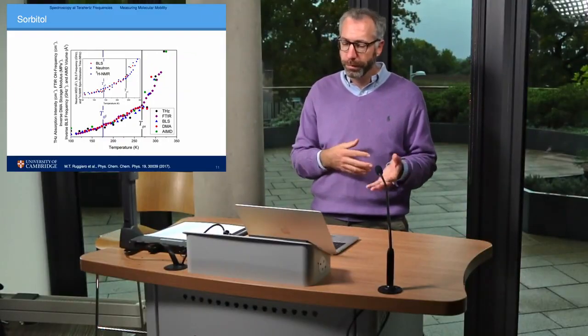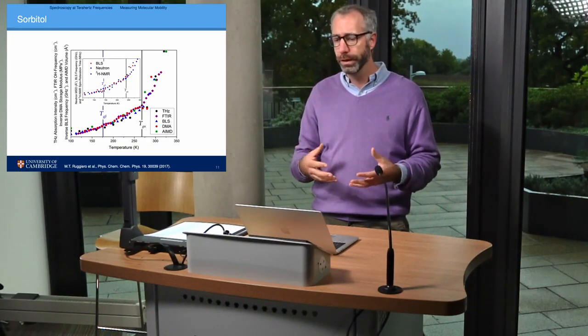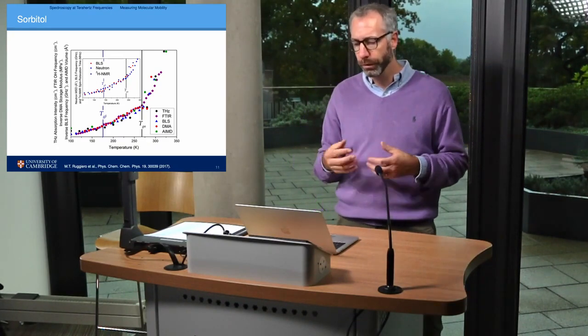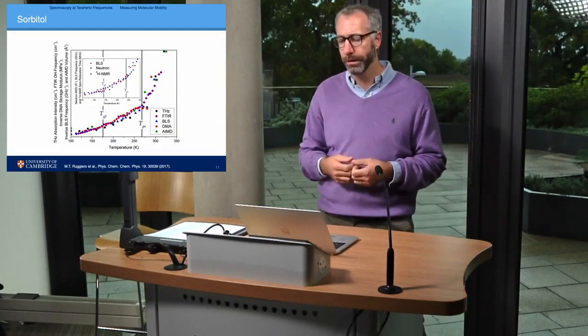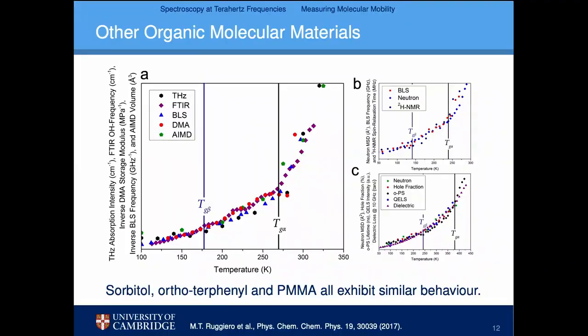However, the terahertz spectroscopy method is really fast experimentally, and it can be carried out within a laboratory very easily. And so given the high sensitivity of the method, there is far less noise in these measurements compared to many other techniques. So the effect is maybe more obvious, and that's why we got interested in it. Of course, this observation is not unique to sorbitol, but it can be observed in all organic molecular materials.